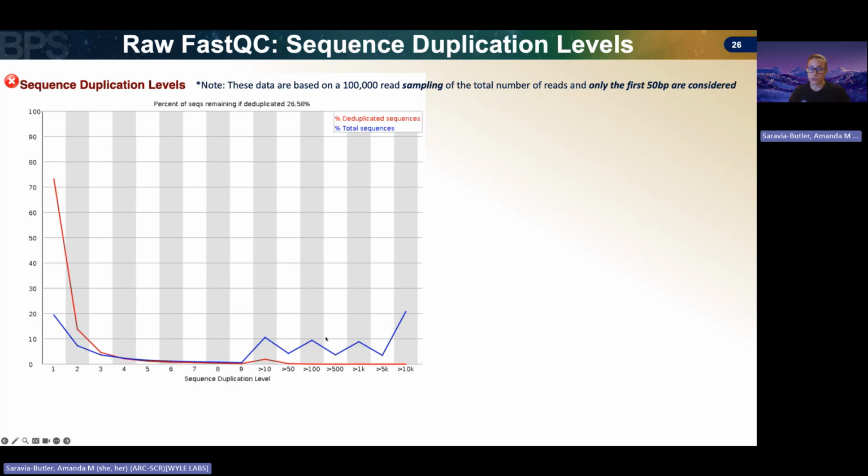And so it's usually an overrepresentation of the number of duplicates. Also, if you remember from the intro sequencing QC Jupyter notebook, this duplicate detection is not going to be able to distinguish between biological and technical duplicates.